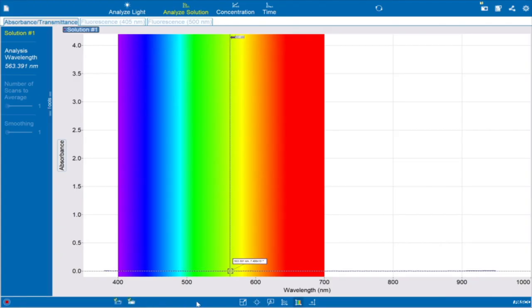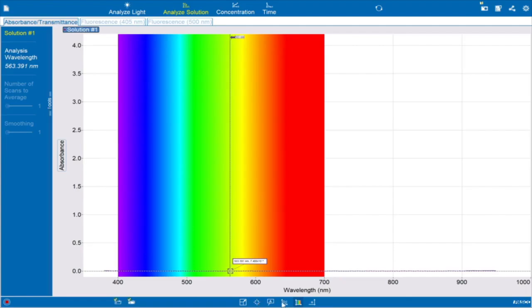To the right of the record button are the Calibrate Dark and Calibrate Light tabs. You'll use these buttons in the procedure to properly calibrate your spectrometer. In the Analyze Solution tab, there are three helpful buttons at the bottom of the screen. The Scale to Fit button lets you see your data scaled properly on screen. The Coordinate tool is used to find measurements on an exact point of your data — make sure to drag and drop the crosshairs onto your data. The Comparison button can be used to display more than one graph of data at a time. If you ever have questions about the spectrometry software, Appendix B in your lab manual has more information.